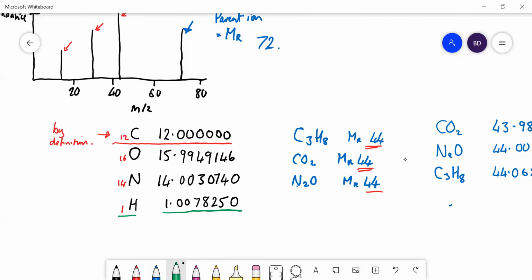And that's because the mass of a proton and the mass of a neutron are not the same in every nucleus. When you have protons and neutrons in a nucleus, they're bound together by the strong nuclear force, which you don't need to worry about, but some of their mass is converted into energy. You know, Einstein's famous equation, E = mc², where E is the energy, m is the mass, and c is the speed of light. So energy and mass are equivalent.